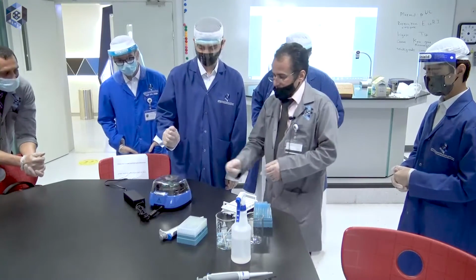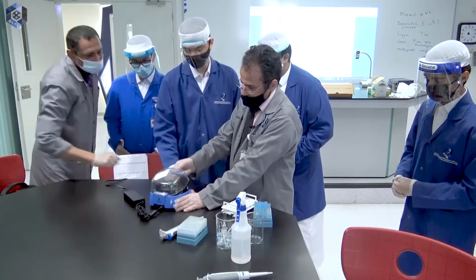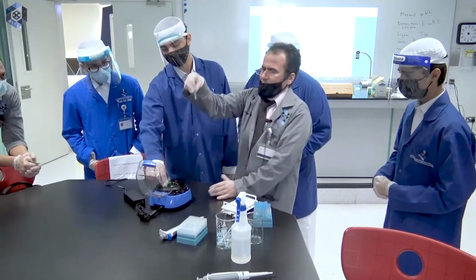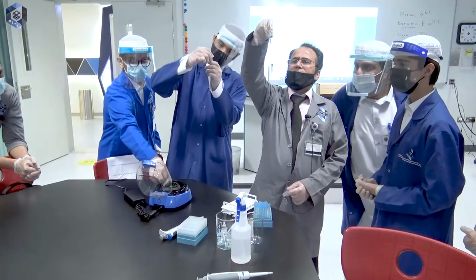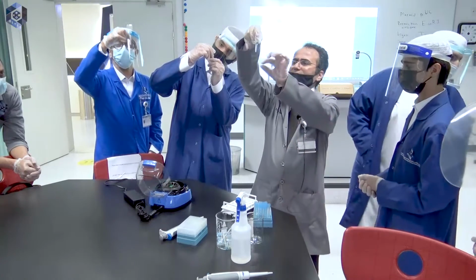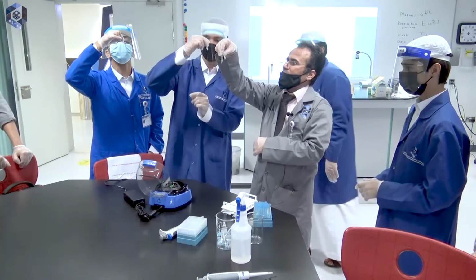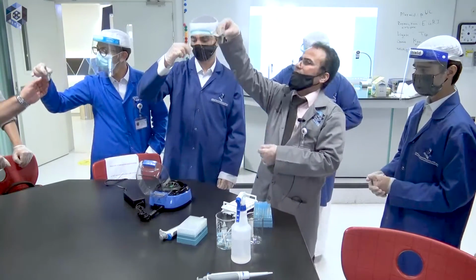Wait. Open. Now, there is a little pellet at the bottom. Check the other one. A little pellet. This stands for the 5 colonies we have.